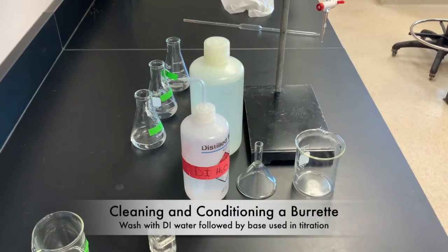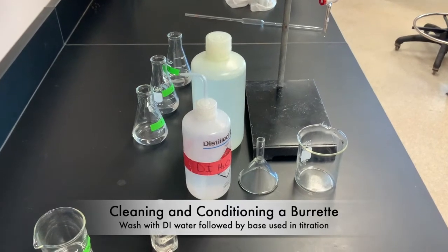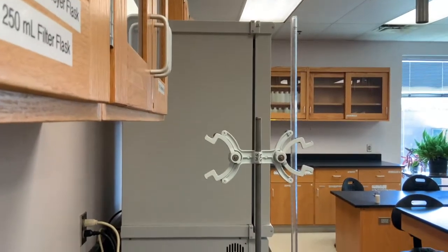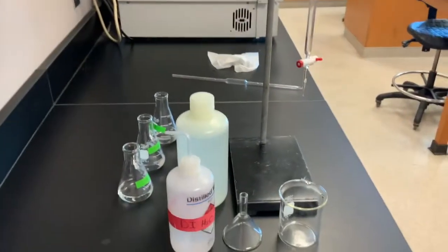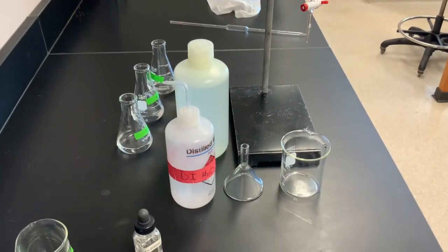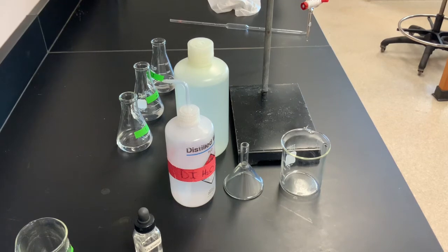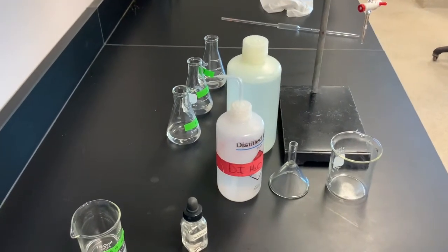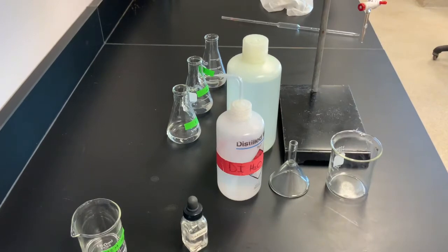So the next thing we're gonna do is clean and condition our burette. So we've got our burette set up here with our burette clamp. To clean and condition it, we're gonna take first deionized water. We're gonna fill a little bit into the burette, and then we're gonna swirl it around and dump it out.